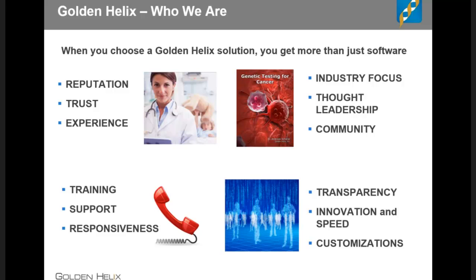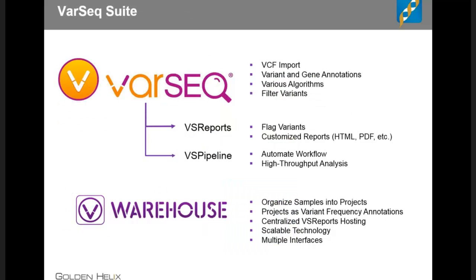Today we are going to be looking at our VarSeq software. The VarSeq technology stack is separated into about four different functionality groups. The main group is VarSeq itself — the desktop application where the majority of the work happens. This is where we import our VCF files, perform variant and gene level annotations, run algorithms like compound heterozygous workflows, and use VarSeq to create filter chains to filter variants down to a set of candidates for further analysis.